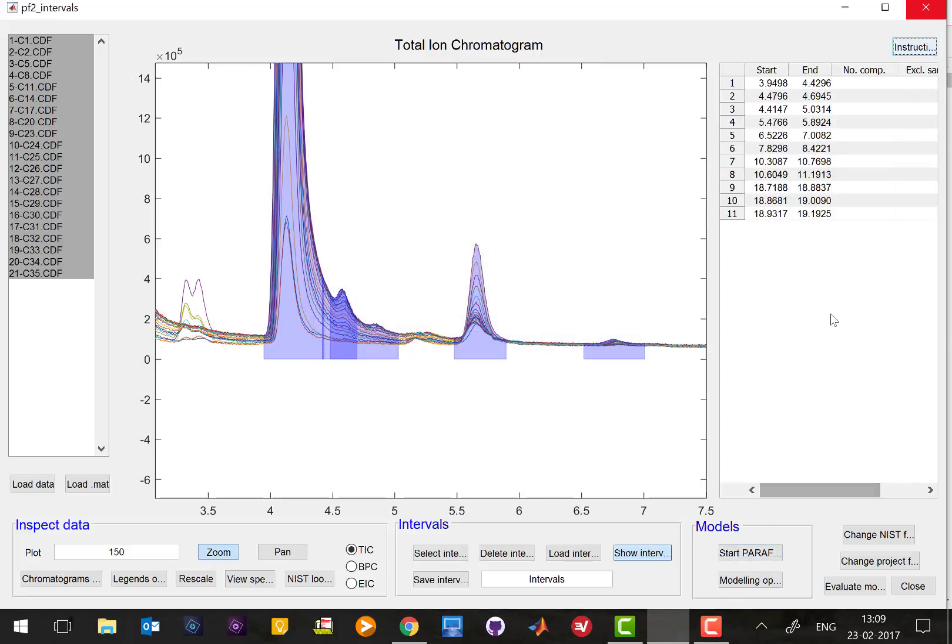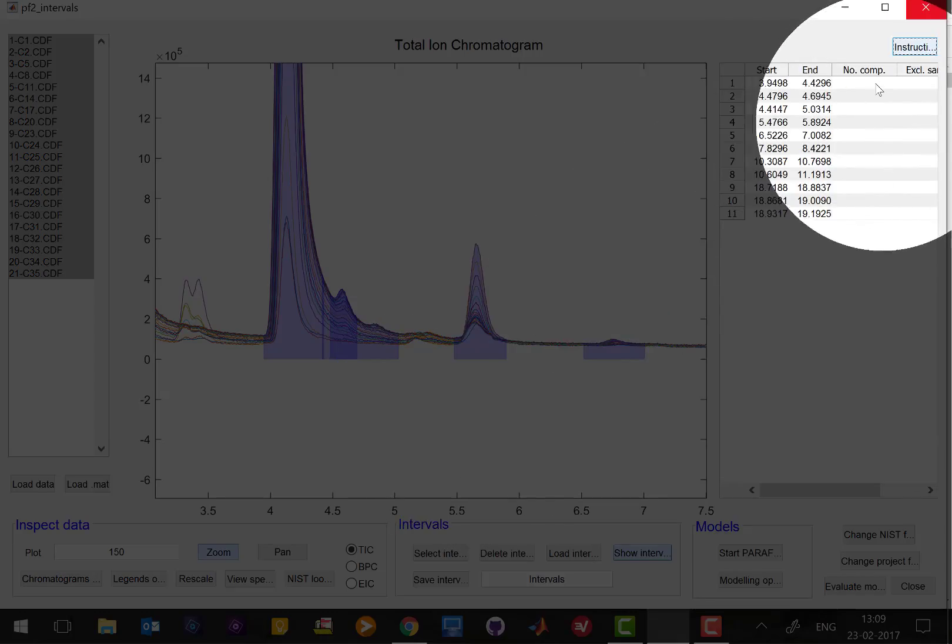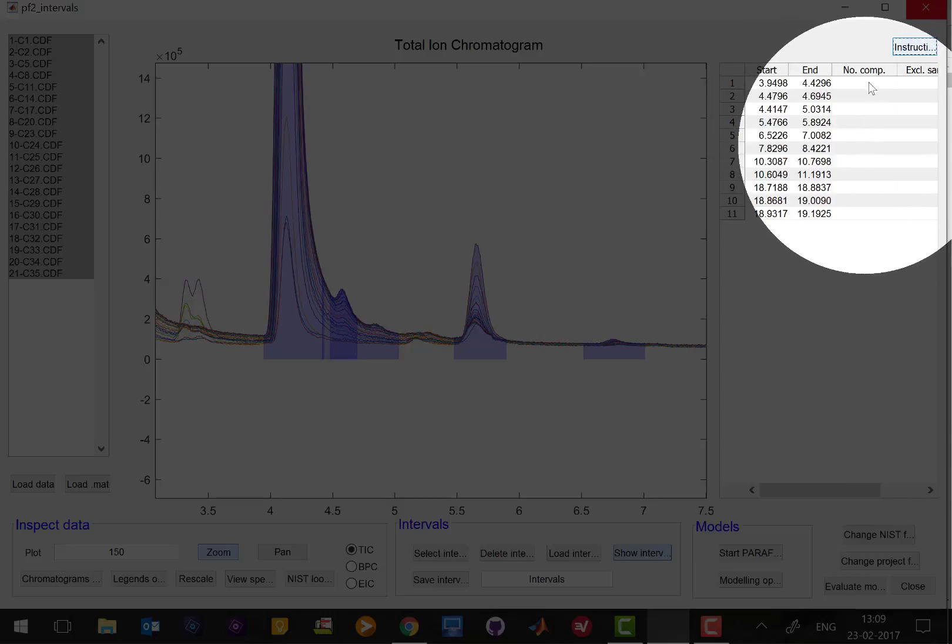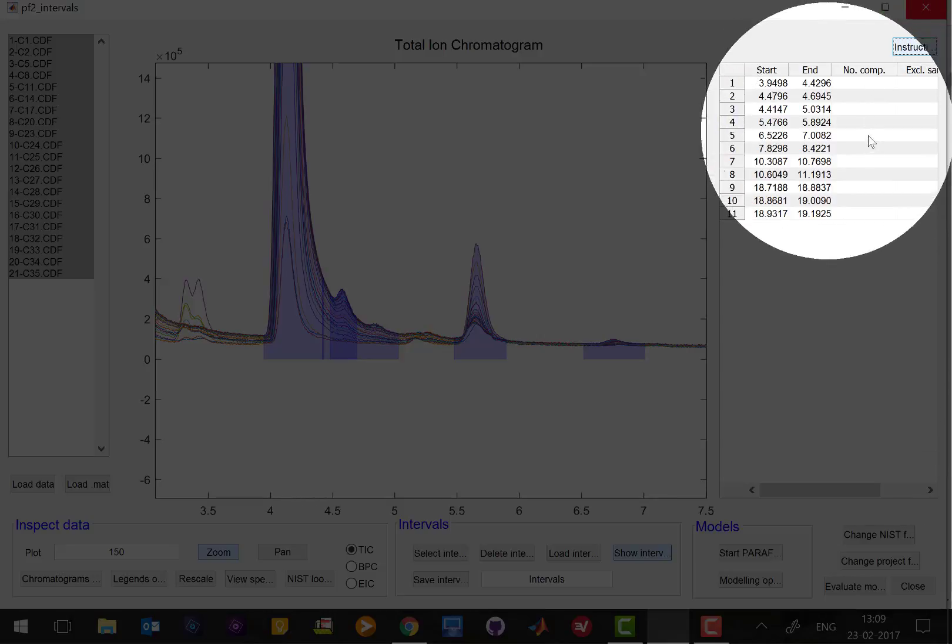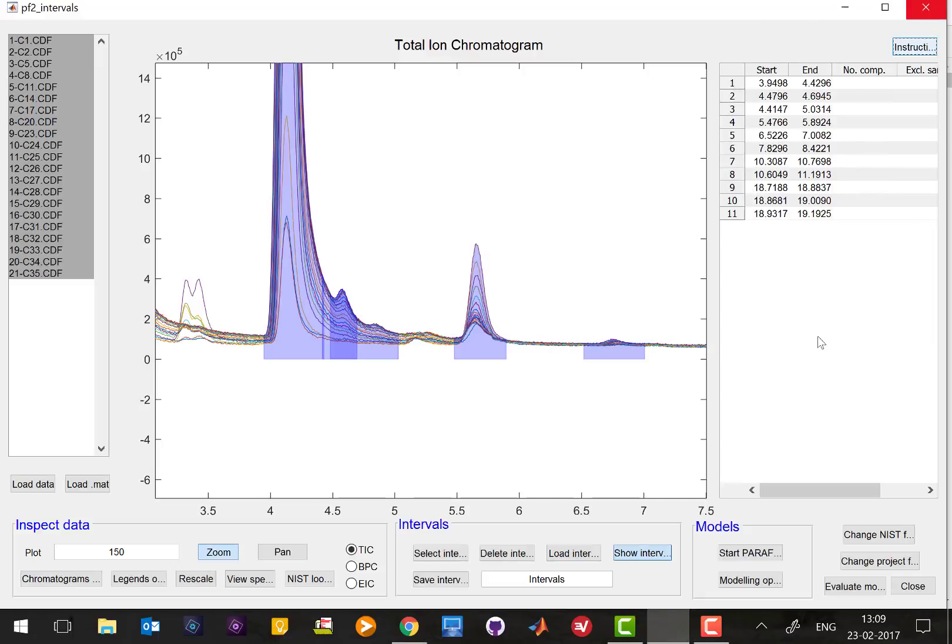But before I do that let me just explain what happened. In the upper corner we have this list of intervals and what you see now is that we have two extra tables. Pexit can you explain?